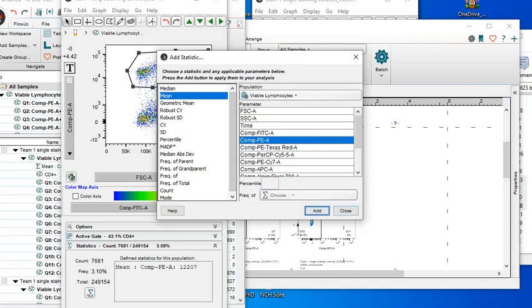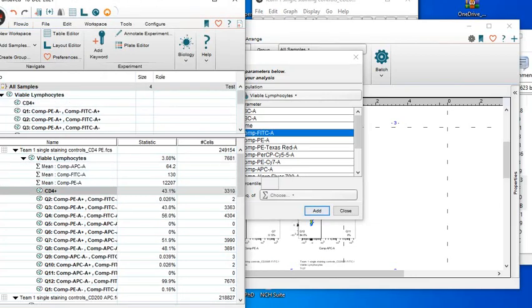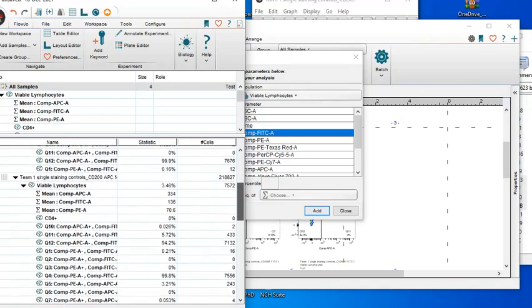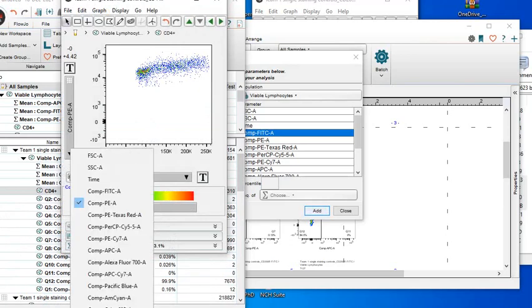You can also do the same thing for your APC, your CD200, and your CD200 receptor. But now we've done this, we are going to gate, lift and place, and do the same thing for the other three. That now applies to every other cell. So the next thing we are going to do in the CD4 cells, we are now going to gate for the CD200.